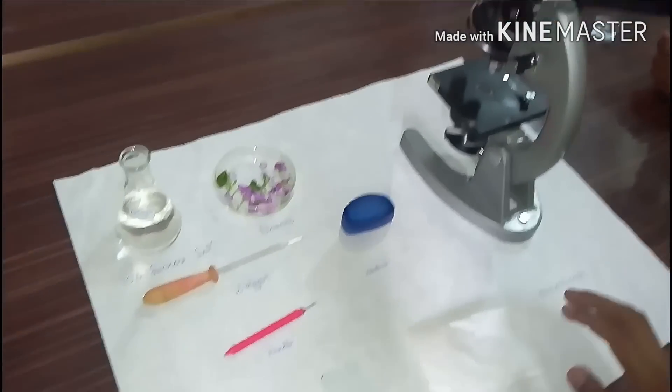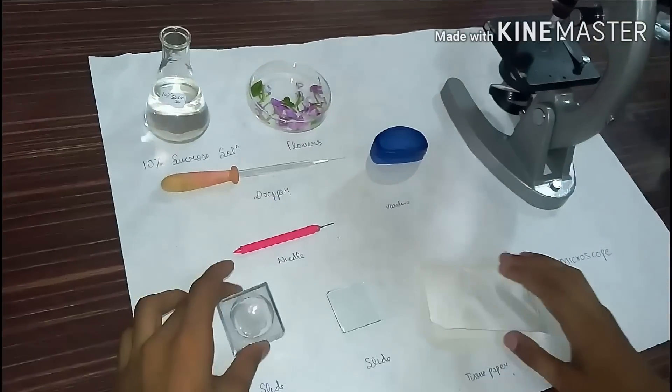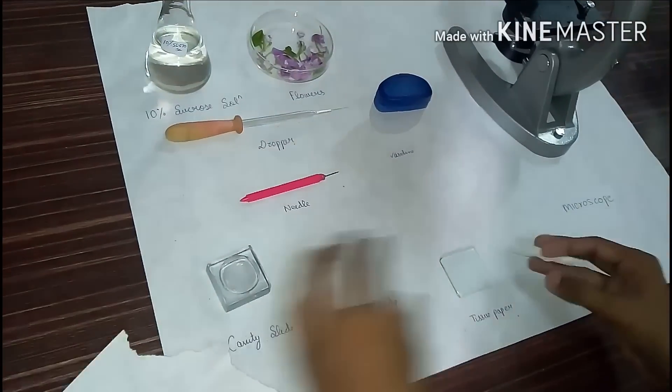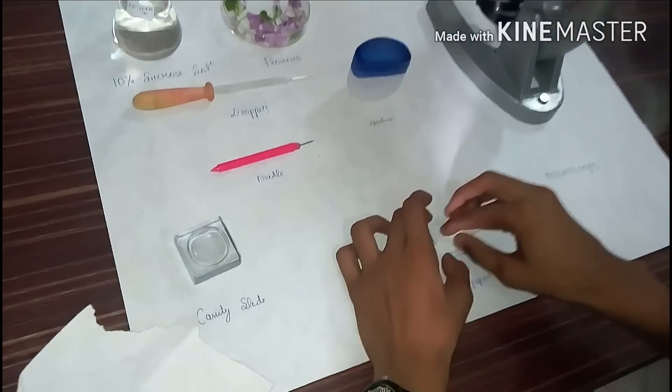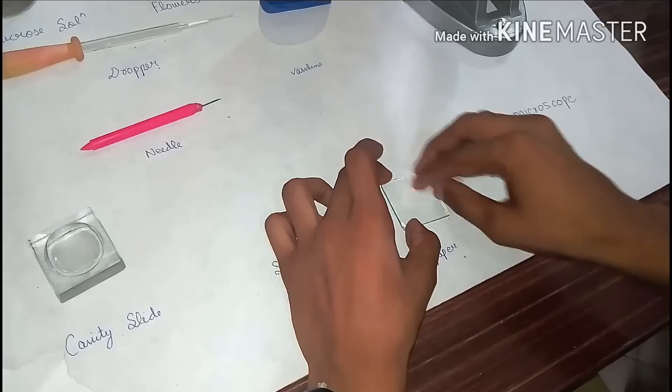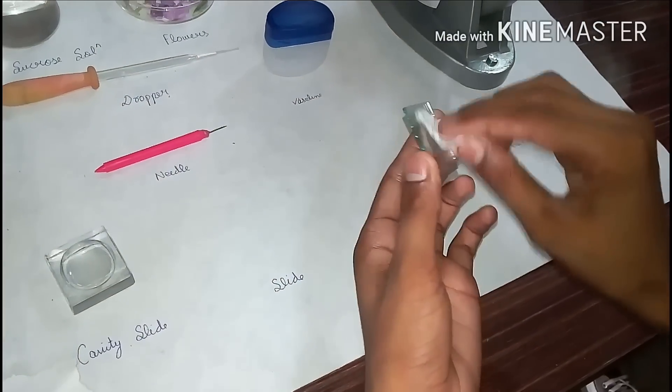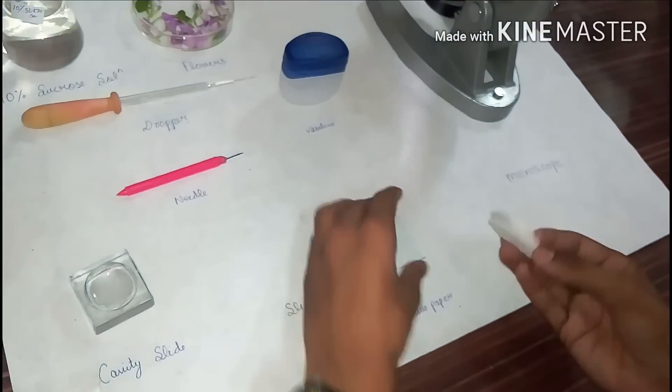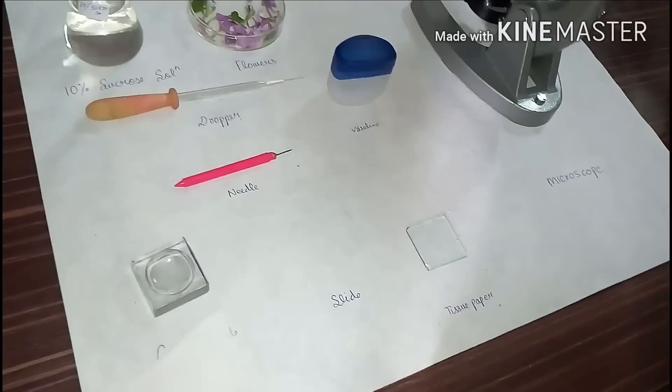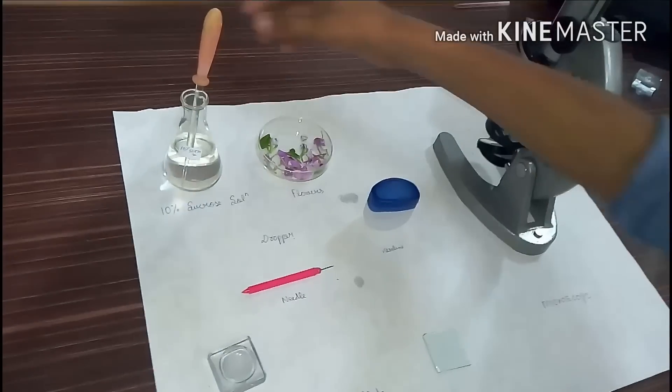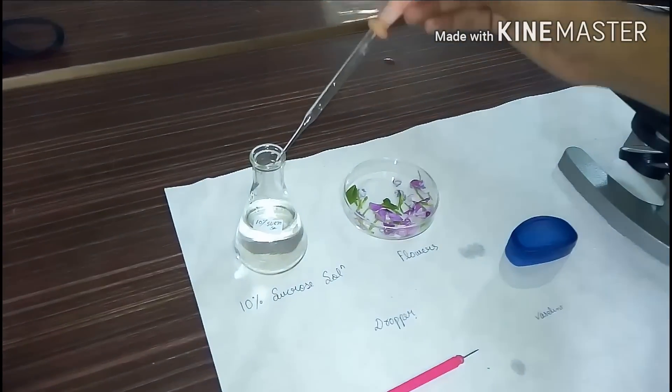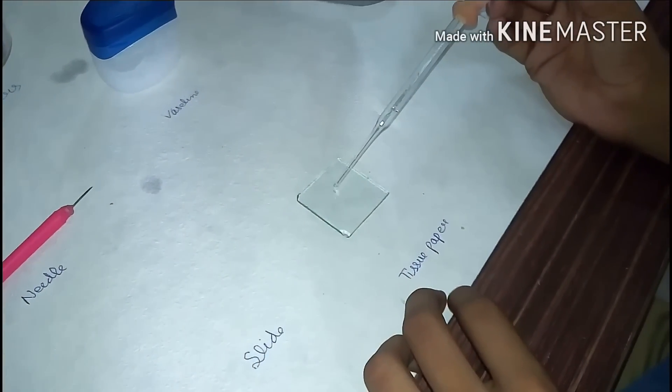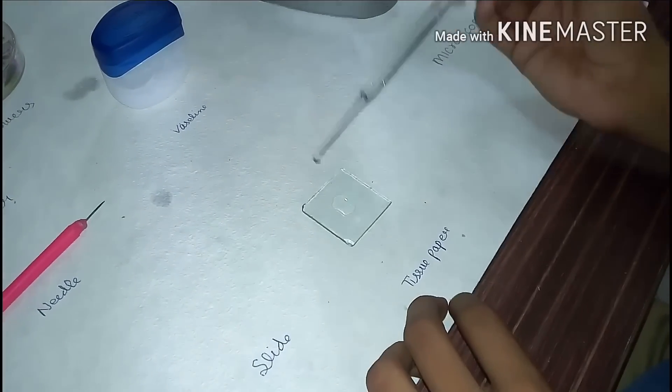And here we start. First we take a slide, we clean it with tissue paper. Clean it properly so that there will be no dirt or anything on the slide so we could have a clean and beautiful slide. We are going to take 10% sucrose solution on our slide, only just one or two drops.